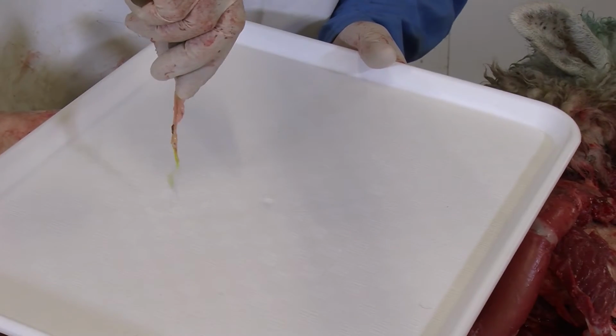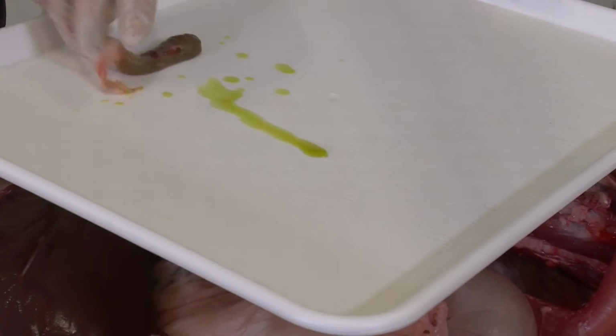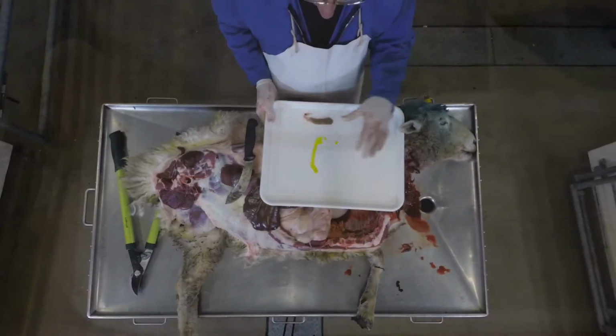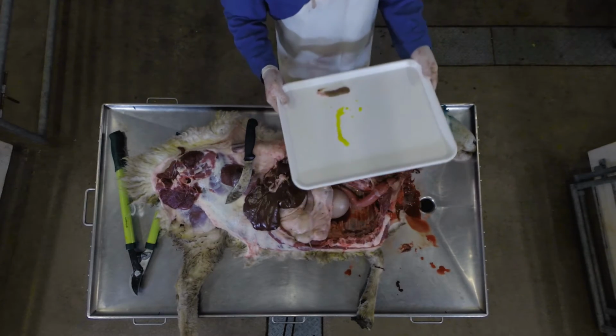So we'll just take some of that. So bright green liquid, and emulsification of fat is its main use.